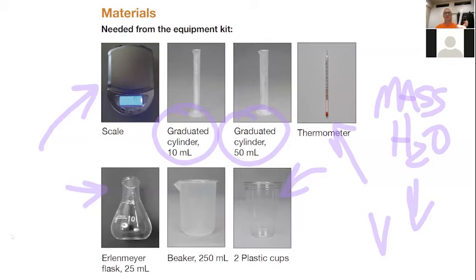Now, if we get a mass of 6.98 grams, we pretty much know that's really close to 7 because the density is around 1 gram per ml, right? But if we were to get something like 5.92 grams, that wouldn't be too accurate.